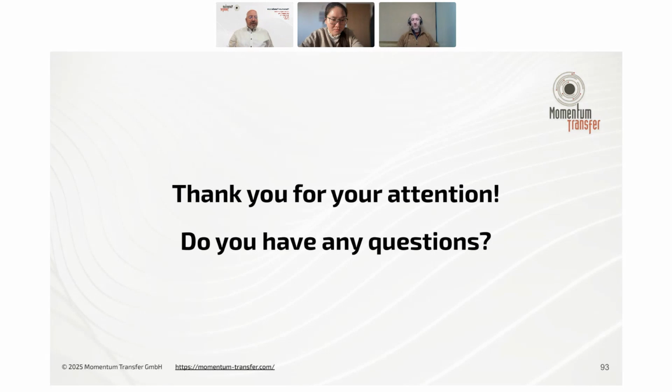So I think we have time for one last question, and that is, is there a possibility to perform in situ PDF under the operating conditions? Yeah, absolutely. We don't currently offer that. We're working in a high throughput format for ex situ ambient conditions, but definitely, any conditions that you can do a powder diffraction measurement under, within reason, you can do a PDF measurement on.